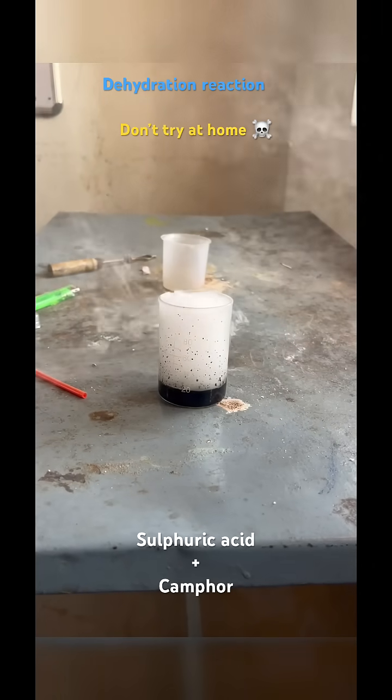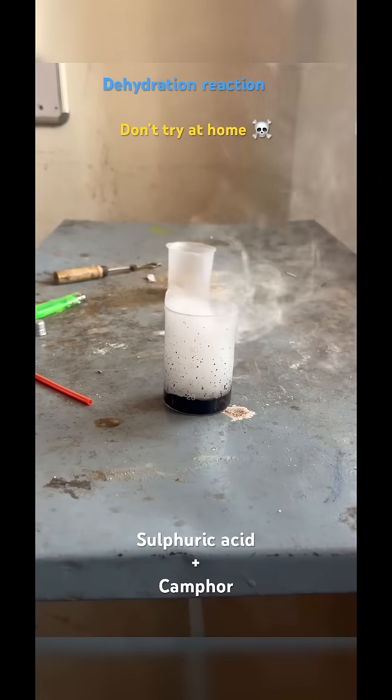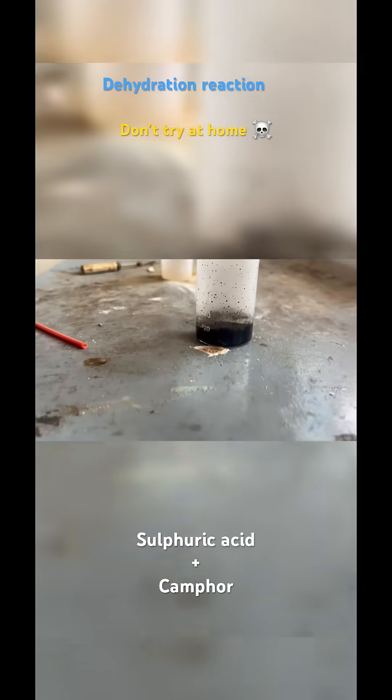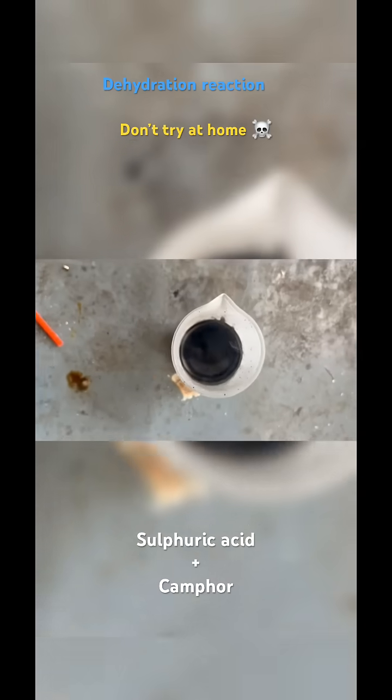You can see how dense fumes we are obtaining here. We are obtaining a black colored tar along with polymers — a black residue. You can see the finished product, the black residue we are obtaining here. Don't try this at home.